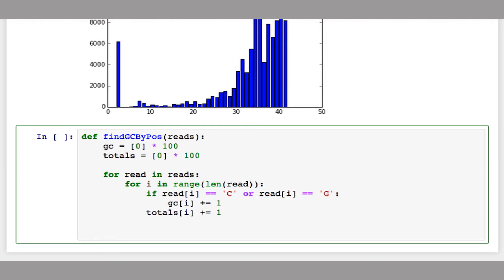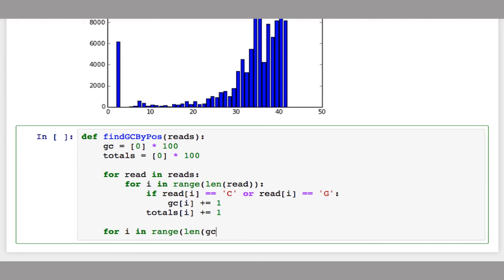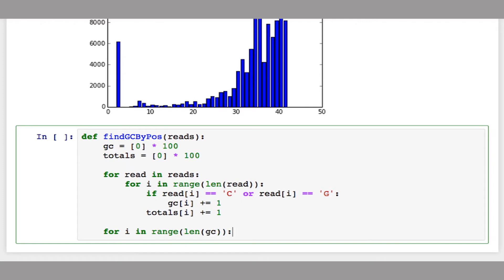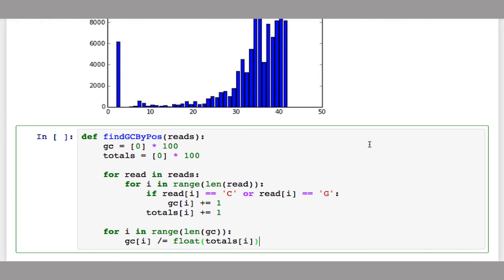Once I've finished this loop, both arrays will be updated. Now I can divide GC by totals to get the average GC content. I'll do this for each base up to the length of the reads: GC[i] divided by totals[i], converting totals[i] to a float so it won't truncate the integers.